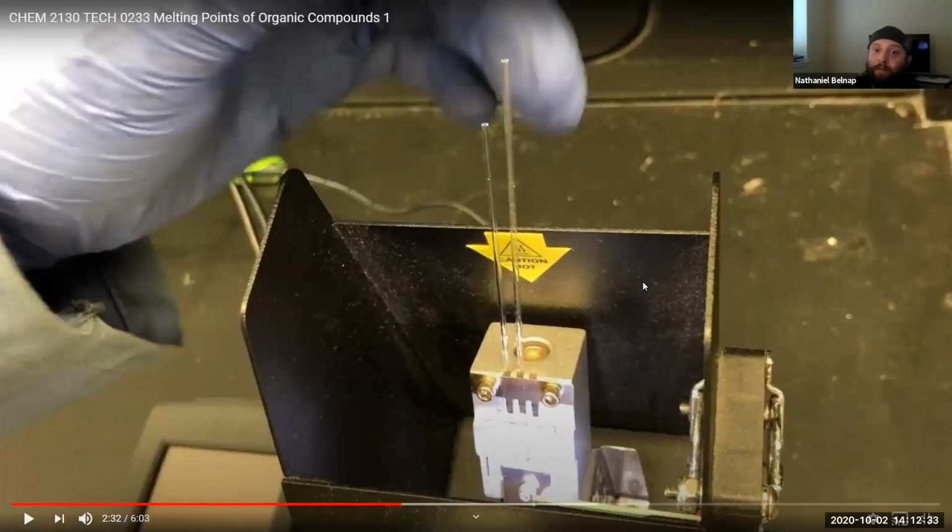So, how would you expect him to melt this if it's a known compound? Like, you know what the melting temperature should be. How would he melt this? Anyone can answer. Like at a slow rate so he can observe the melting point.